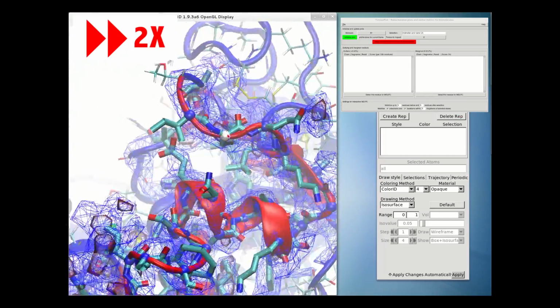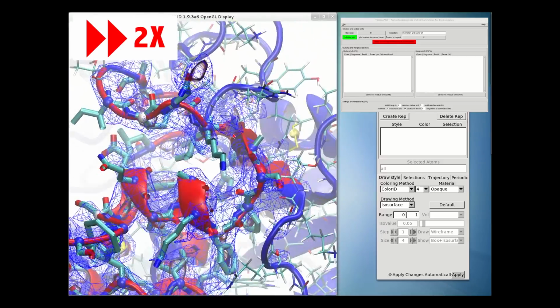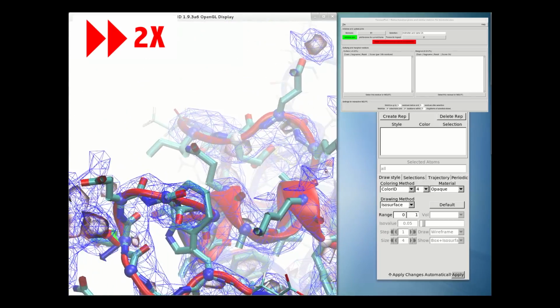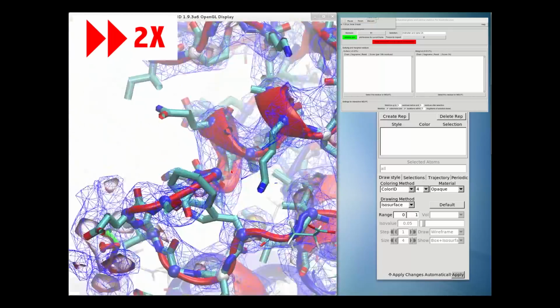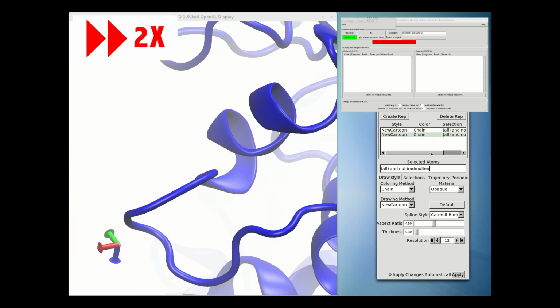Here's one example where direct manipulation of coordinates remains a necessary evil. There's been a particularly bad steric clash here, which has left the backbone threaded through the ring of a tryptophan side chain. Clearly this can't be fixed within the simulation, so we'll drop back to our static main molecule and simply move side chain atoms until they're all on one side of the backbone. Don't worry about mangling the geometry, this is easily fixed with a quick energy minimization.